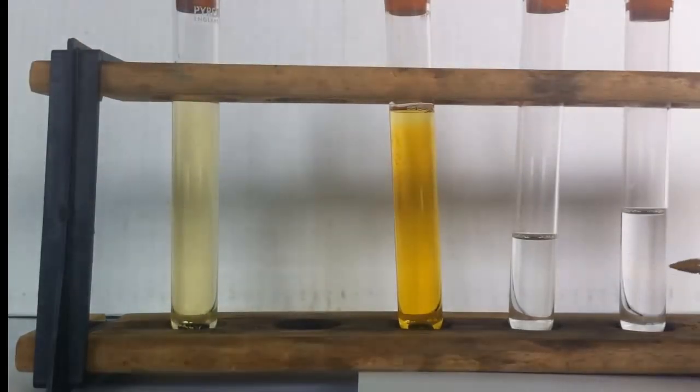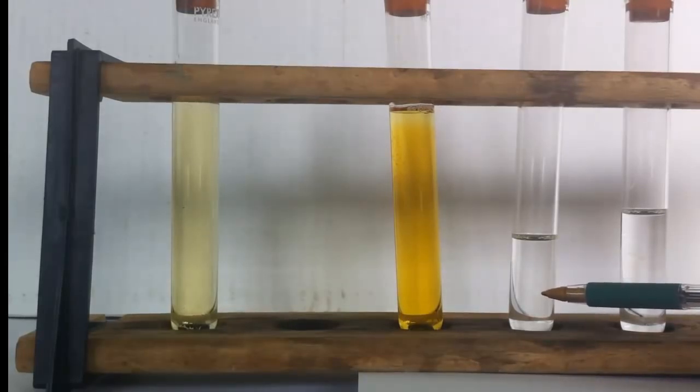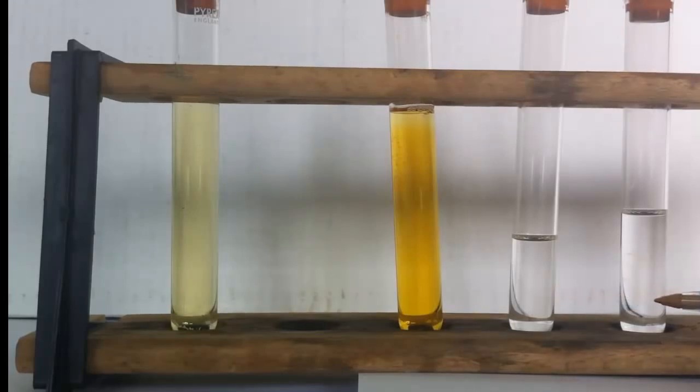In these two test tubes I have liquid hydrocarbons. This is cyclohexene which contains a carbon-carbon double bond in each molecule. And this is cyclohexane. It has no carbon-carbon double bonds.